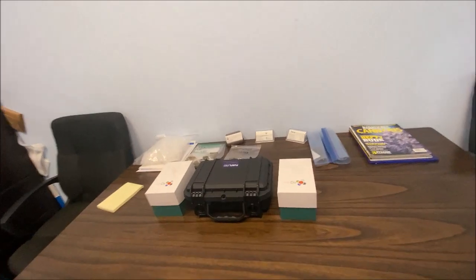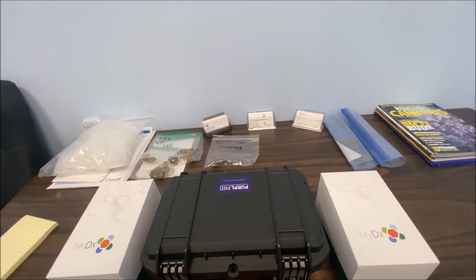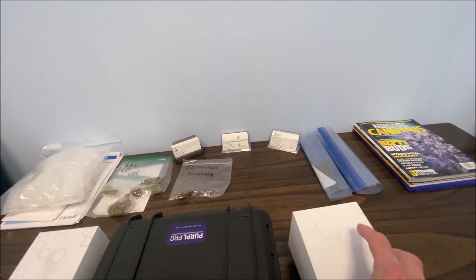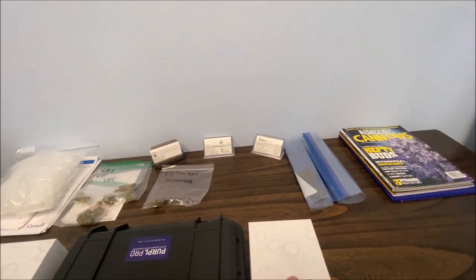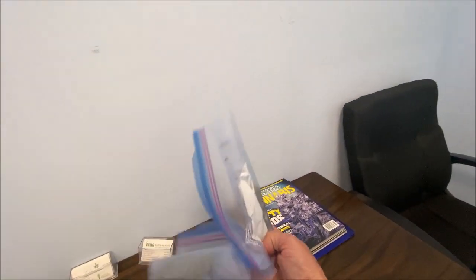So here we are. Here's our testing equipment. This is not the nuclear codes to the atom bomb. That's just our PURPL Pro tester. This is our DX tester. The DX tester is a molecular sniffer. That's the one we use for terpenes. You can see I've got a lot of test samples here that are going to be tested, and I've got a couple of my own right here that we're going to test.